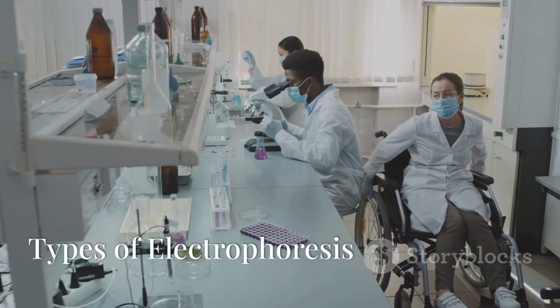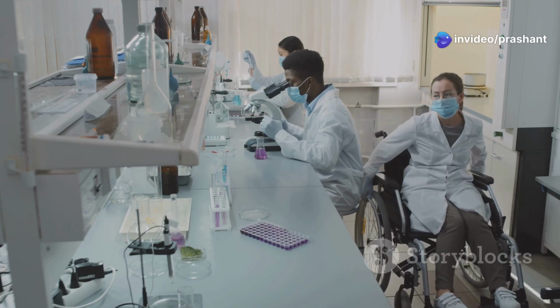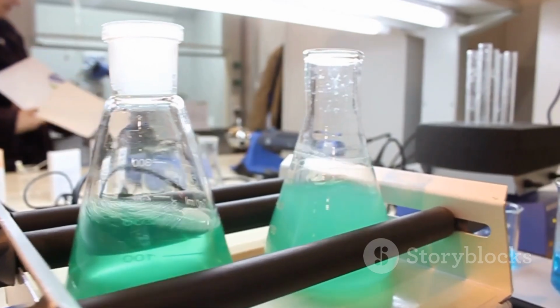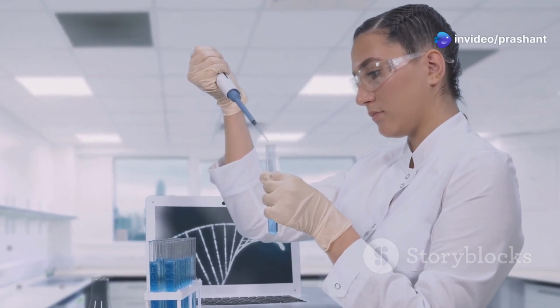Now, there are several types of electrophoresis methods, each suited for different types of molecules and applications. Let's go over the main ones you need to know for your course. First, there's paper electrophoresis. It uses a paper medium soaked in a buffer solution. It's a simple, affordable technique, often used for analyzing small molecules and amino acids.